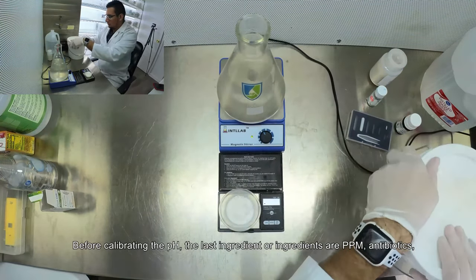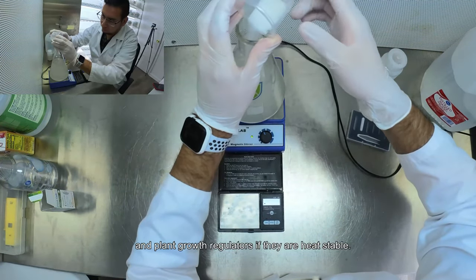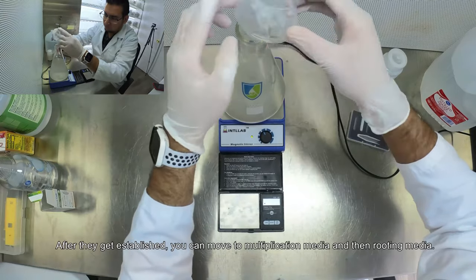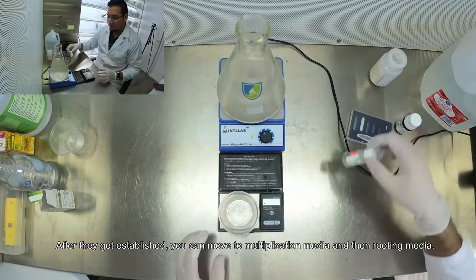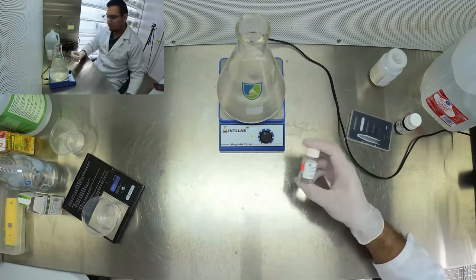Before calibrating the pH, the last ingredient — or ingredients — are PPM antibiotics and plant growth regulators, if they are heat stable. This kit is good to get plants established in tissue culture. After they get established you can move to multiplication media and then rooting media. So in this case the last ingredient before calibrating the pH is PPM.